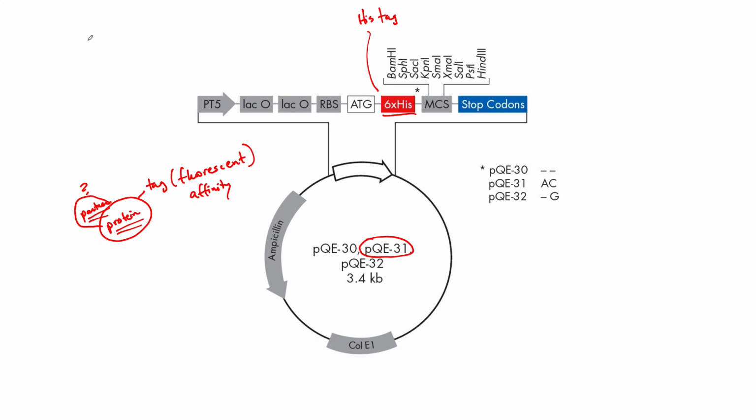if you have this cell with all sorts of proteins expressed in it, including the protein that you want to know about, that you've cloned into the plasmid here, how do you separate that protein out and the partner that it's bound to and exclude all the other proteins that are in the cell so that you don't accidentally look at them and get a mixed message of what's bound to what?